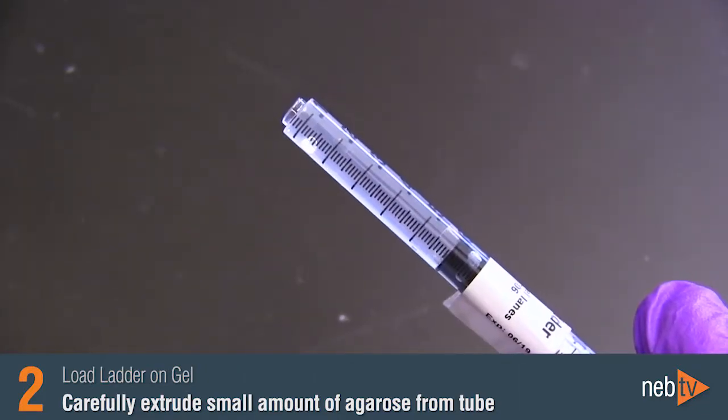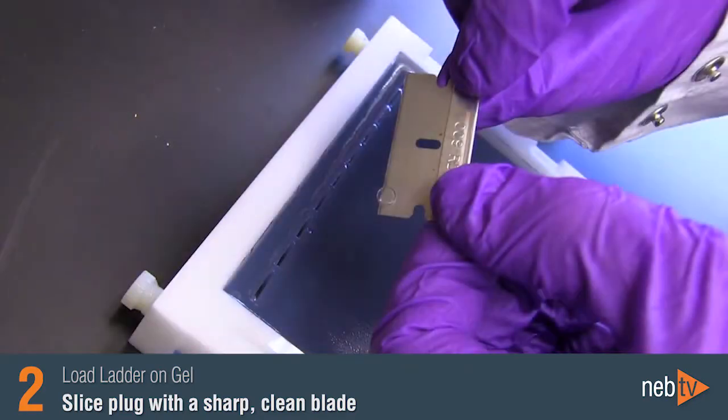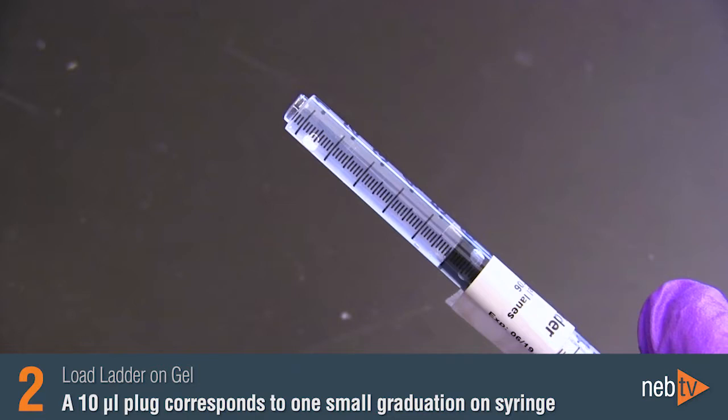To load the PFG marker plugs, remove them from the freezer and extrude the agarose from the syringe carefully. Slice a plug from the end with a sharp, clean blade. The thinner and flatter the plug is, the better. We recommend a plug size between 5 and 10 microliters. For reference, a 10 microliter plug corresponds to one small graduation on the syringe volume scale.